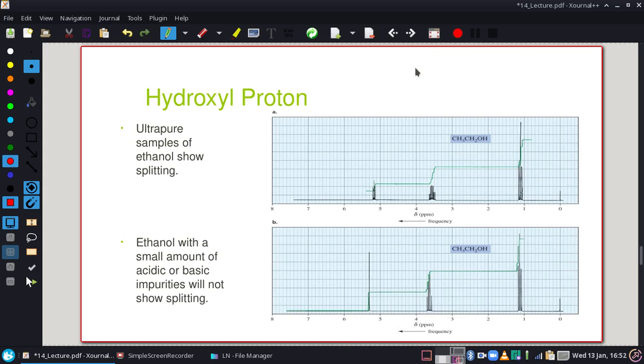Let me show you what I mean by looking odd. This is that OH peak down here. And if you notice this one, it's got a messy little scattered peak. It's not really like a triplet or quartet. We have an asymmetrical peak going on here. Yet down here, it's really nice and clear. Matter of fact, even this one, see how noisy this looks? And it really is, because this one may or may not get split by an adjacent hydrogen from a different molecule. And same down below.